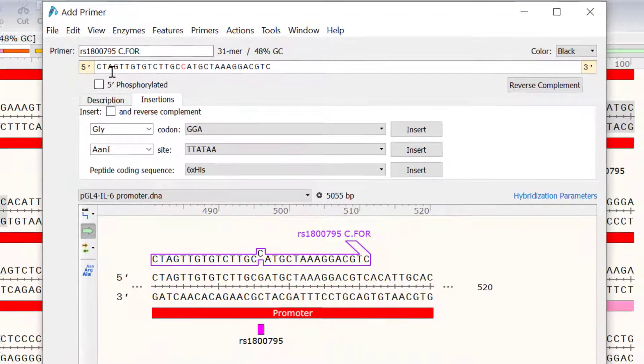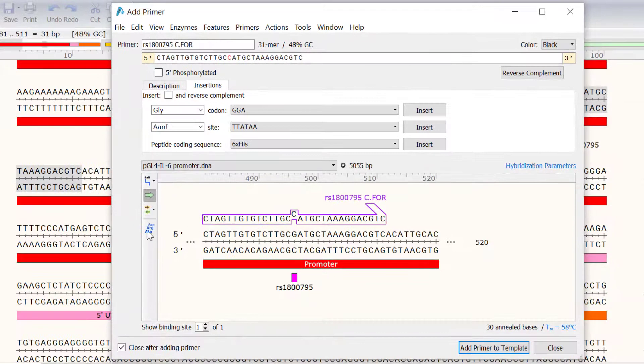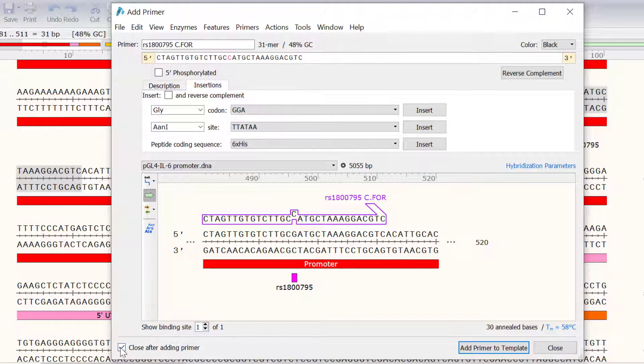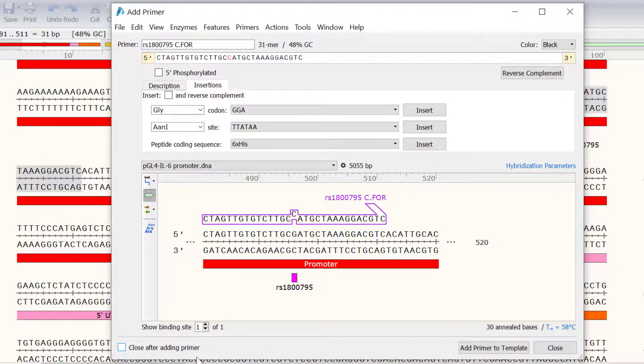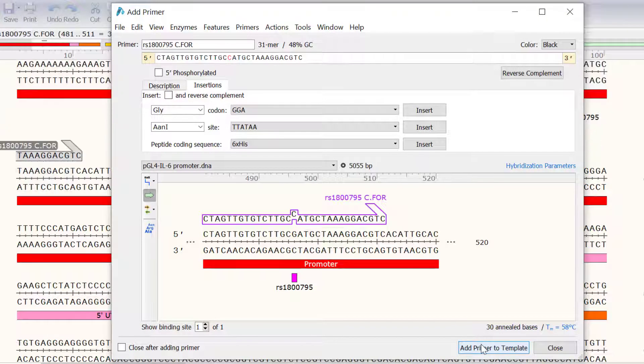So, I will firstly uncheck the option to close the window after adding the primer, and click Add Primer to Template to save this forward primer.